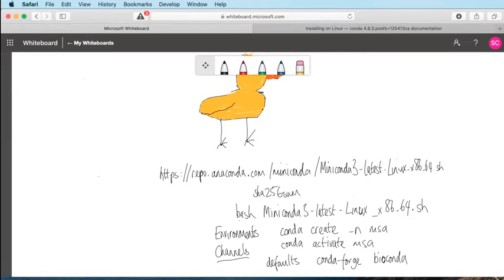So let's go to our whiteboard, whatever this is. We'll take a note of it up here. Where's my pen? There it is. Okay, so what was it? Muscle, -in, in file, -out, out file. Straightforward enough.